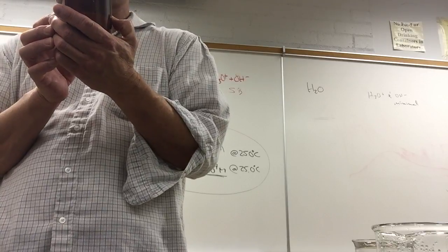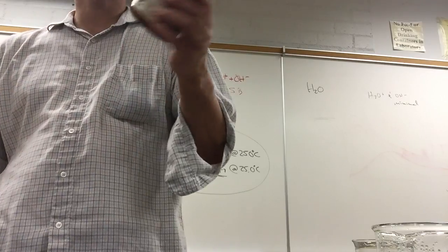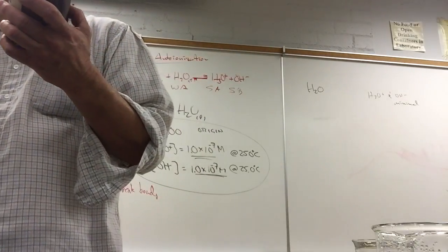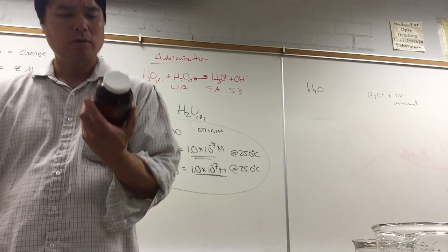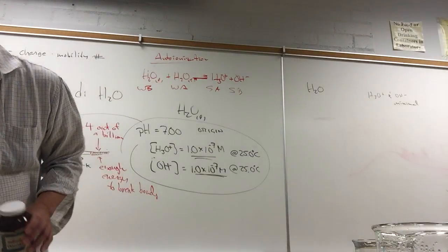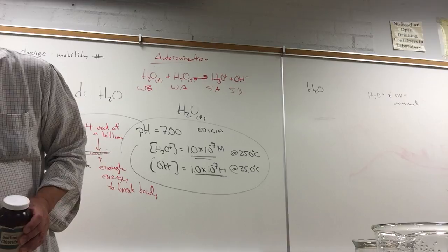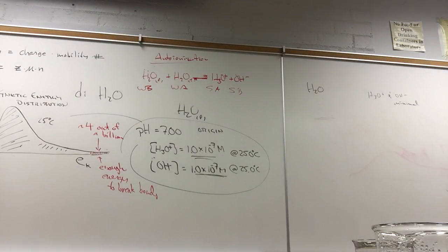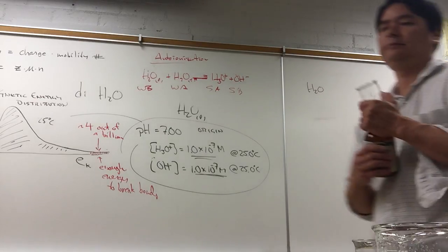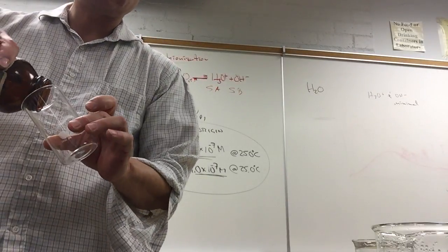This stuff is much more expensive than the stuff you get at the supermarket, but it's still not high purity. This looks like maybe 99.5% pure. It was pure enough. I need a small beaker. All right, solid sodium chloride.